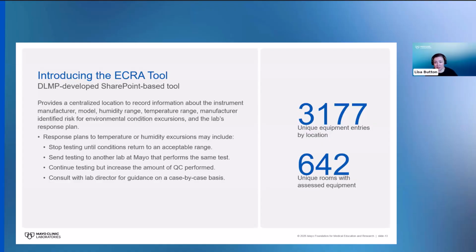Some common response plans I have listed here in these bullet points. Some labs will stop testing until the conditions return to an acceptable range. Some labs will send testing to another lab at Mayo that performs that same test. Some labs will continue testing, but increase the amount of QC that they're performing. And some labs are choosing to consult with their lab director for guidance on a case-by-case basis.